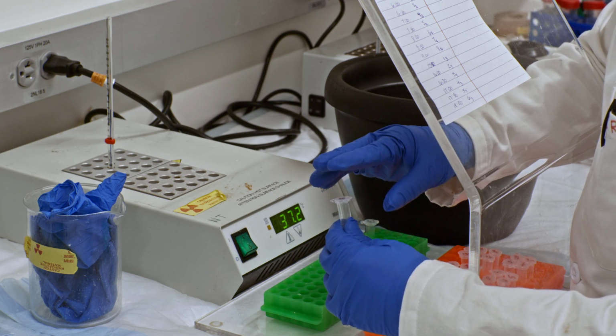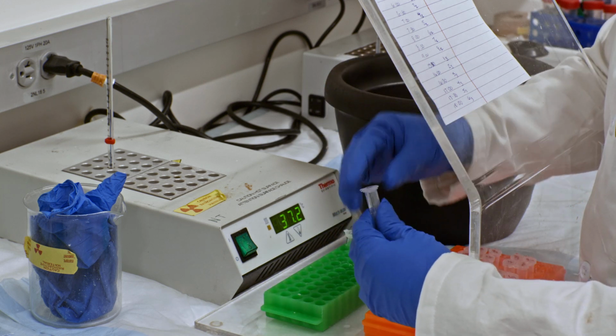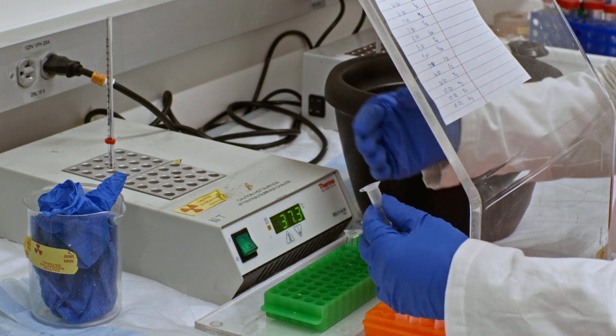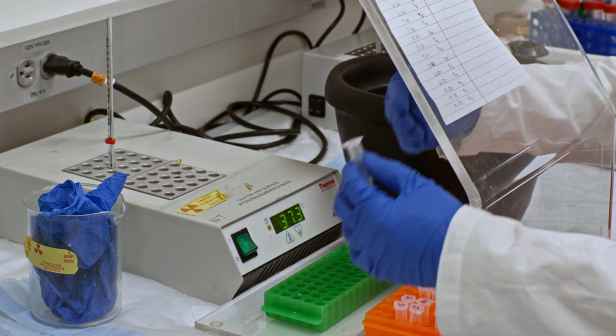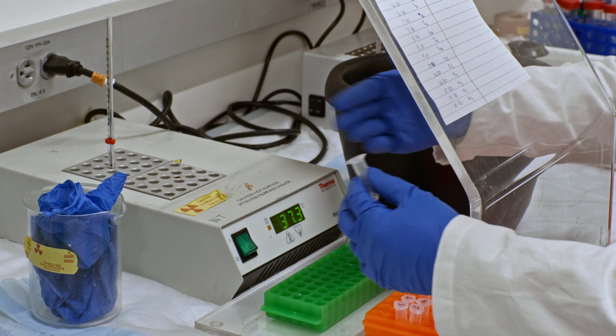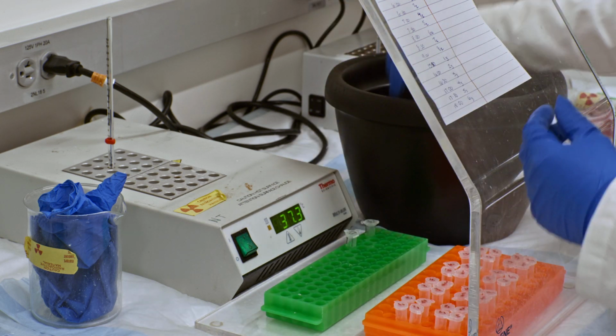The reaction buffer typically contains salts that are important for the activity of the enzyme, such as magnesium chloride, since polymerases need this magnesium in order to coordinate any sort of deoxynucleotide triphosphate that's coming in order to catalyze the reaction. Here in the room, we're going to add 2 things to those reaction vessels.